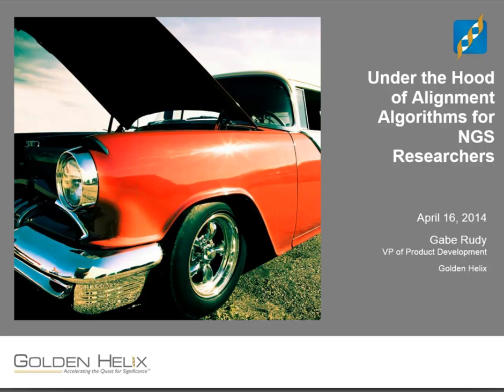All right, thank you very much, Jessica. So welcome to this webinar. I'm very excited to cover this topic today as I get to dive into my computer science roots. We're going to really get into the details of alignment algorithms, which is a fundamental and must-know part of any NGS analysis. And we're going to spend time being hands-on and cover the context in which your alignment algorithm choice makes a difference.